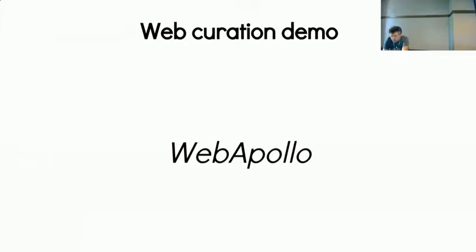So this is Honeybee. This is actual data. Well, you're running it on your own box. Oh, sorry, yeah. We have a demo server. If you go to Genome Architect, which is the name of it, there's a demo and all sorts of things, so you can mess around with it. And all the details I'm missing will be there.